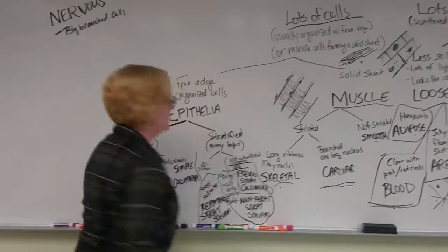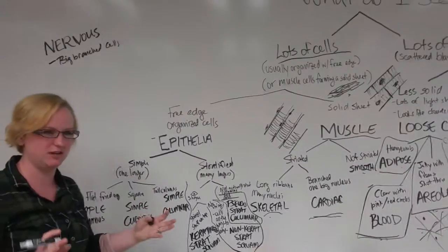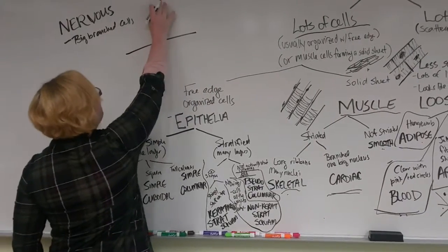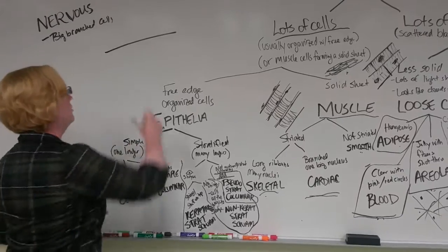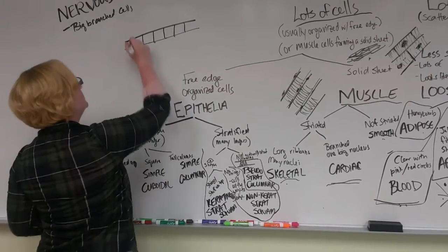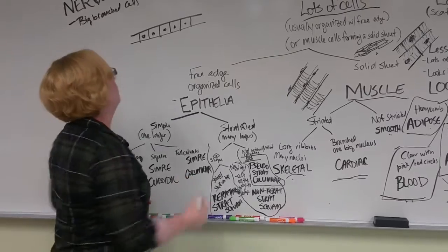The other thing that you can see are lots of cells, again, so like not just random stuff with little nuclei spread throughout, but clearly organized cells. So for example, you would see like a free space or an edge, so it would be white up here, just light shining through. And then you would see just a row of densely packed cells that are nicely organized with a nucleus in each one.